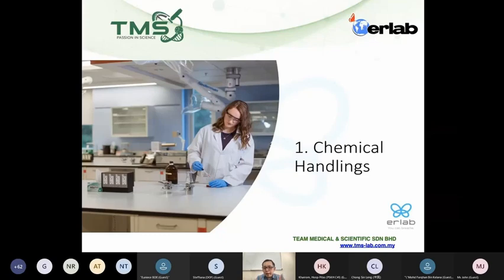About the engineering controls that you can use when you handle chemicals. We'll talk basically today about two applications. One is chemical handling. The second one is engineering control for chemical storage, right?